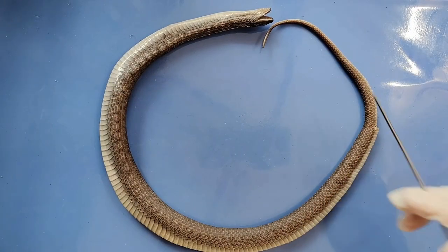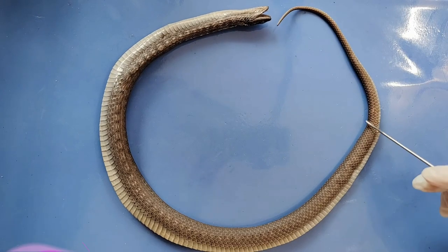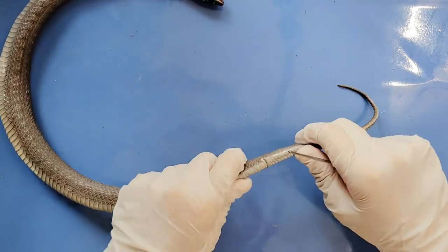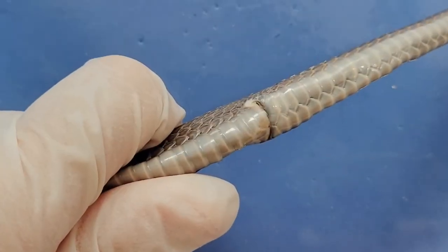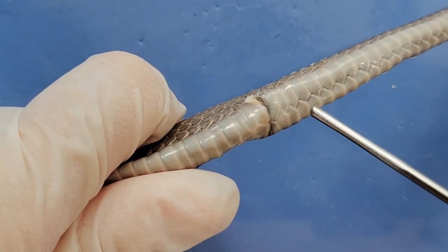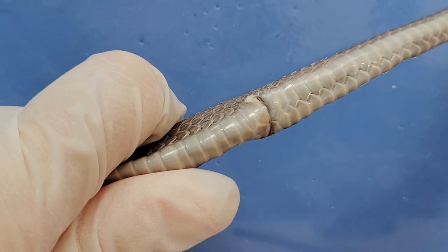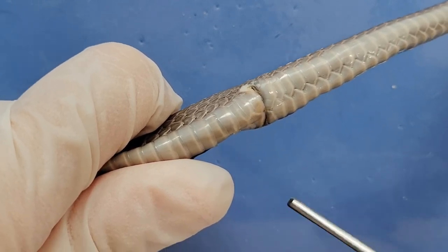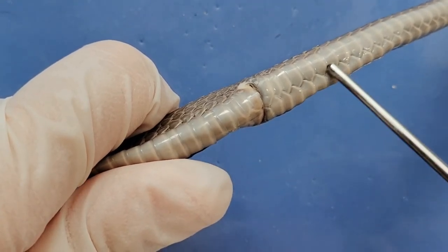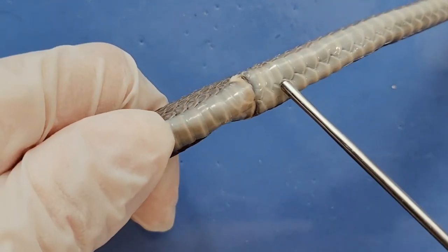Now if we follow the snake towards its tail end, we can see the cloaca right here. The cloaca is the exit for both the digestive and urogenital systems. Another thing to note is that past the cloaca in the tail region, the ventral scales become smaller — the ventral scale before the cloaca is much larger than the ones past it.